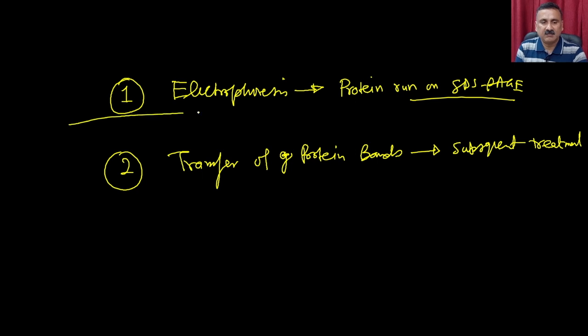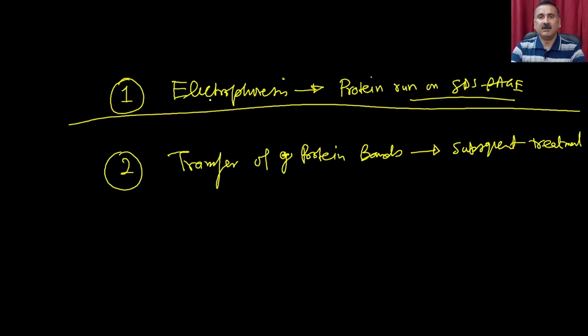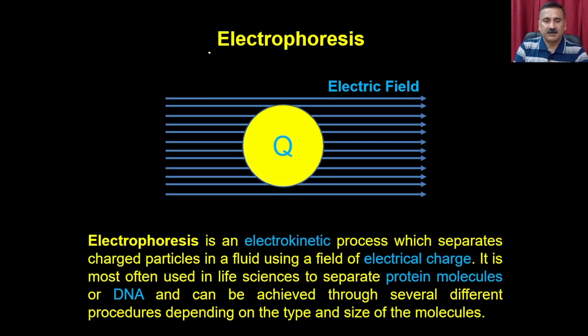So let us first discuss the electrophoresis, though we are not going to discuss it in detail. We are only going to tell you how to perform the electrophoresis and how to perform the SDS page, so that it will become a complete learning experience. So, what is electrophoresis?